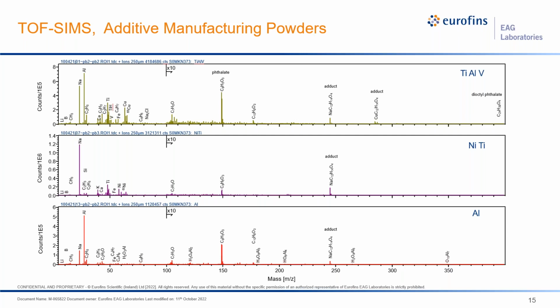But we also see things we didn't expect. Lithium, boron, calcium, iron, and a pretty strong signal for copper. In addition, we pick up the organics. We detected phthalates and detergents on these samples also.